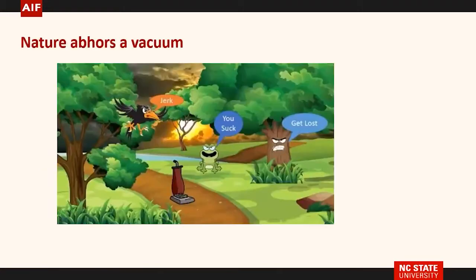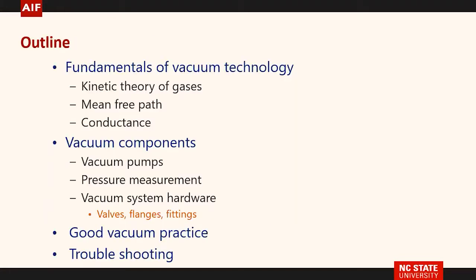You've probably heard nature abhors a vacuum, and that's true. It doesn't like it, but we need it for what we want to do. Here's an outline. We're going to spend a little time on the fundamentals. Then we'll use a lot of time on the vacuum components to make you familiar with these items if you're not. We'll have good vacuum practice and troubleshooting at the end.